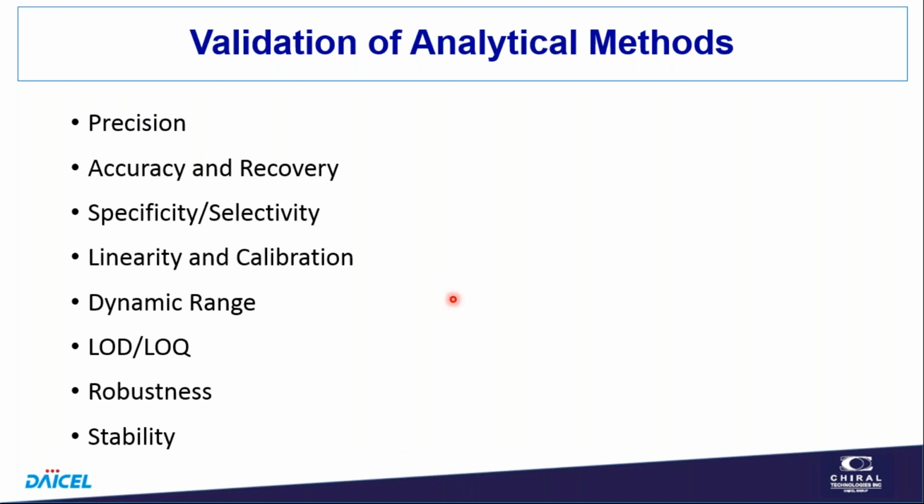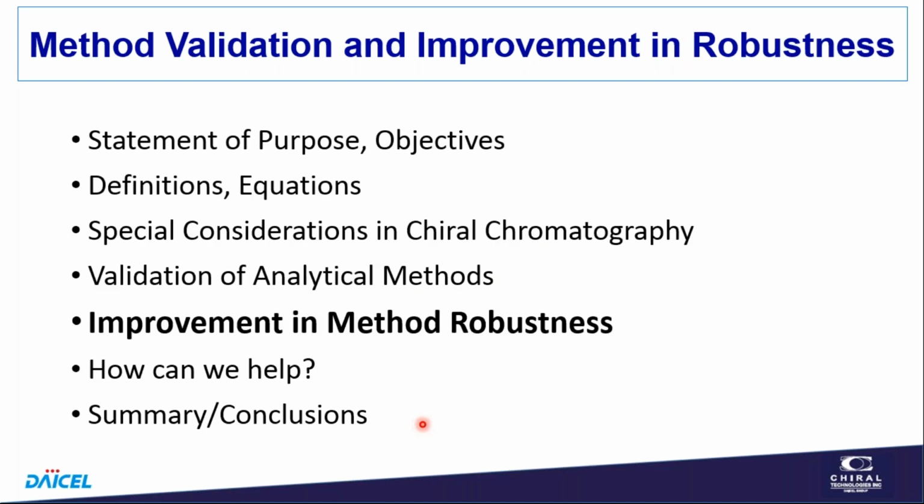Okay, so this is probably nothing really new. The only issue is we're dealing with a ratio of a major component to a minor component. But still, I would treat the minor component analysis as an impurity. And so the things that you and your organization do for analyzing impurities would be fairly similar to what you would do with analyzing a chiral component.